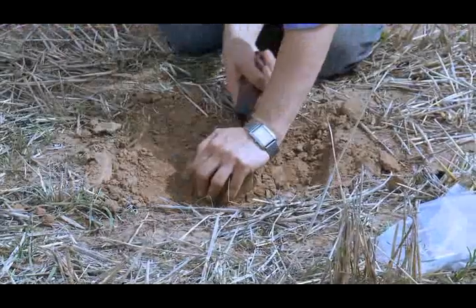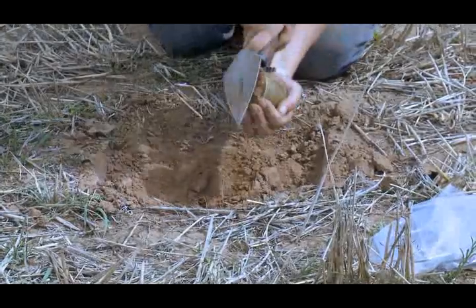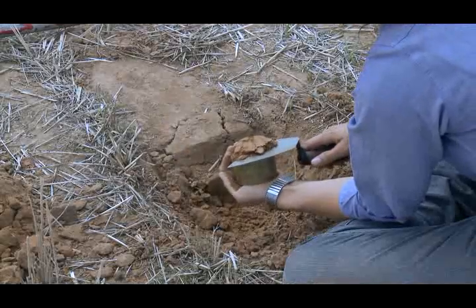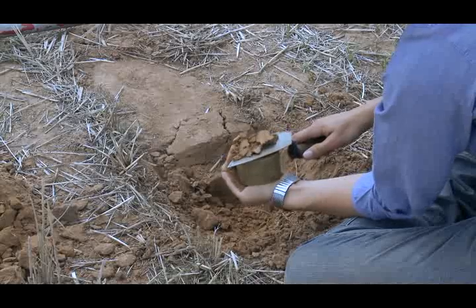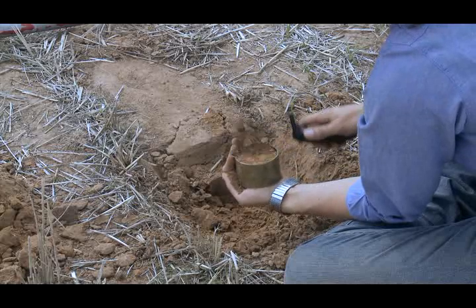Step 4. Using a knife, cut the ring away from the soil surface, retaining all soil and core in the ring. Step 5. Carefully remove excess soil, ensuring the core is flush with the ring at both ends.